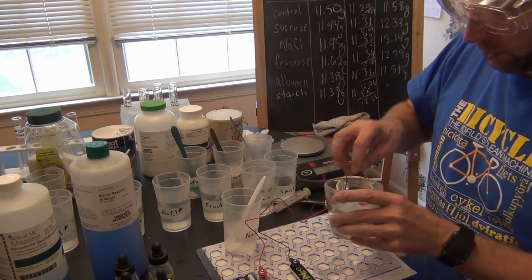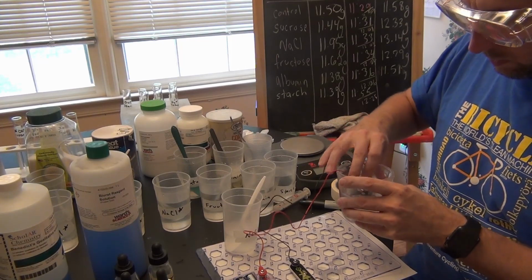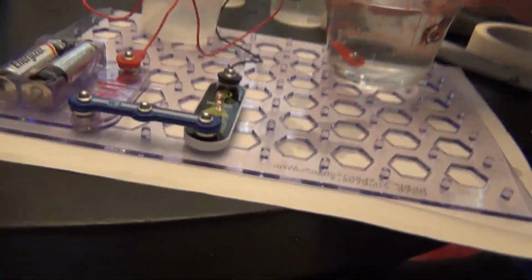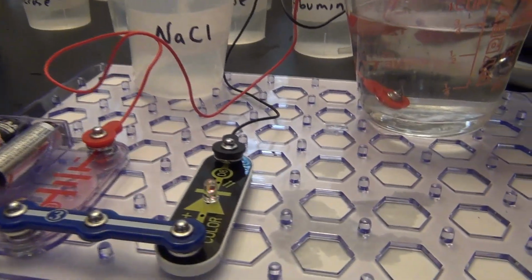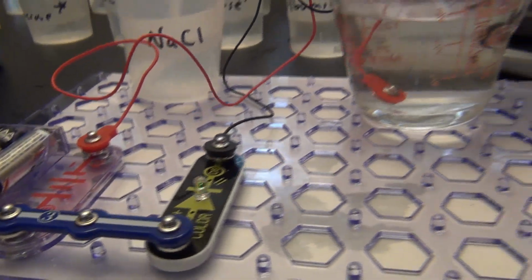I haven't tried this before until now. Okay, actually I want to show you up close a little bit better. So the LED with the plain tap water is lighting up a little bit, showing there must be some solute in my tap water naturally.